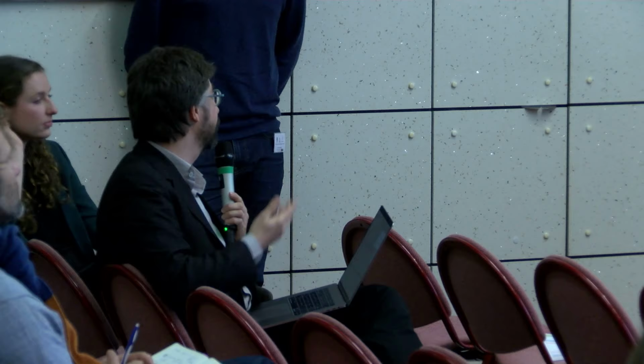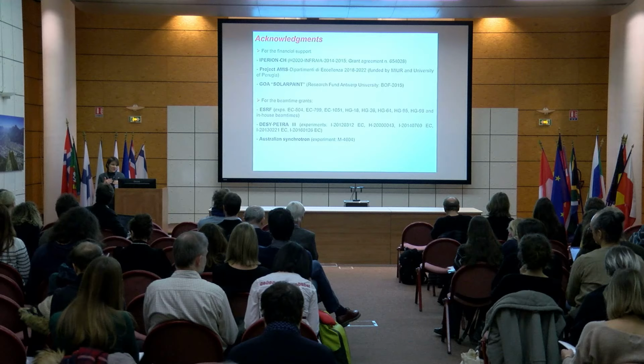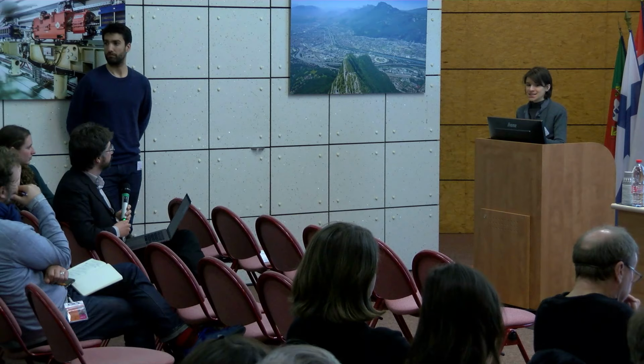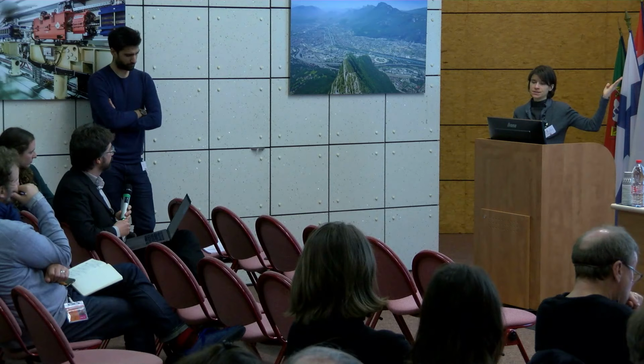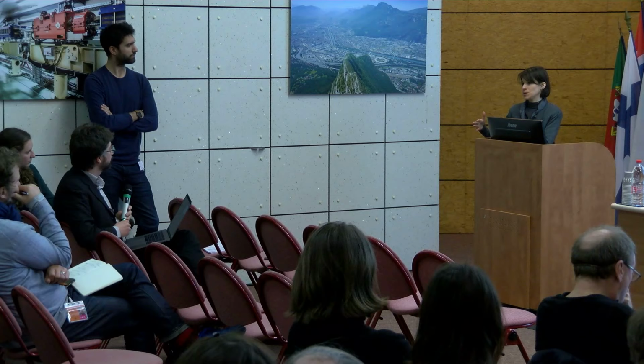So first of all, the first approach should be to do systematic experiments on mockups that are as close as possible to the paint that you want to study, by trying to change the composition. For example, in the case of Prussian blue, our tests have been done in mixture with lead white, because this was the situation that we had in our painting samples.